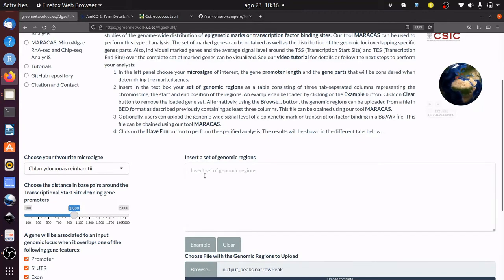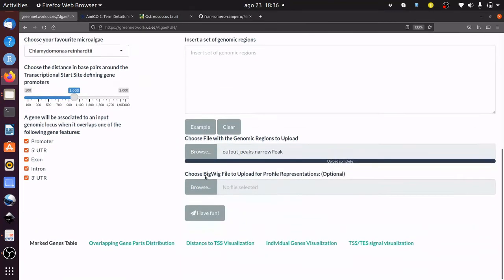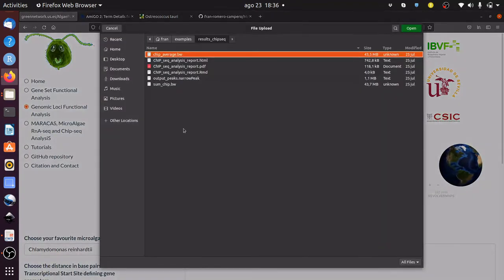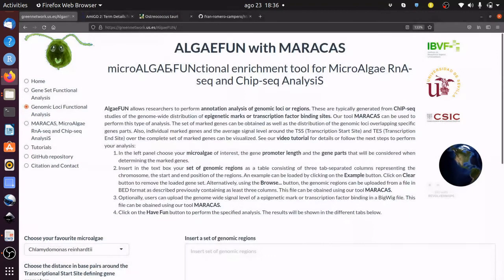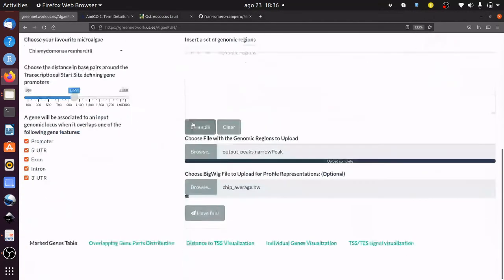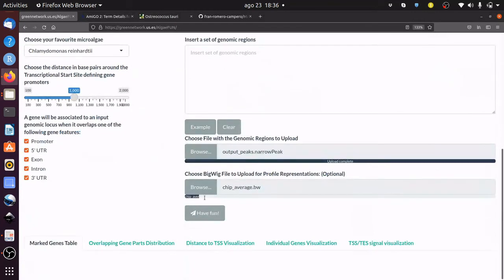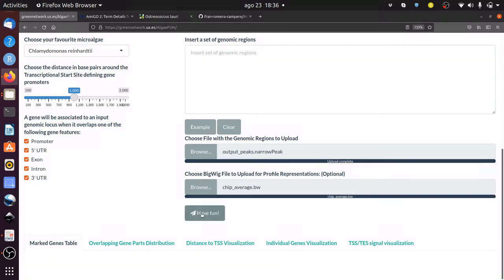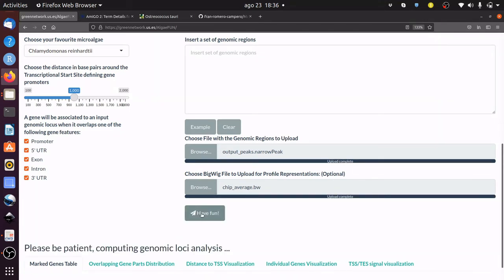Optionally, the genome-wide mapping signal in BigWig format can be uploaded. This progress bar shows the process of uploading the file. Click on the Have Fun button to perform the analysis. Please be patient while computing.